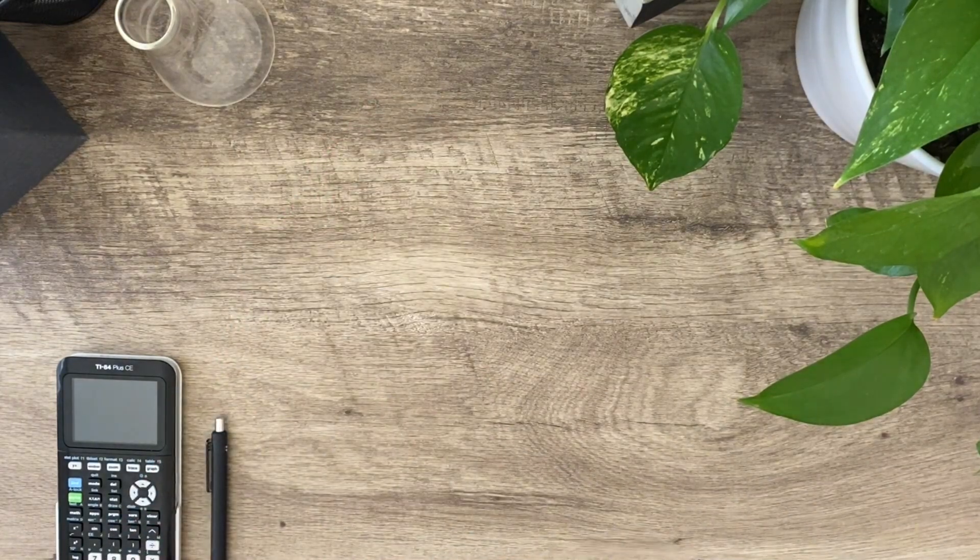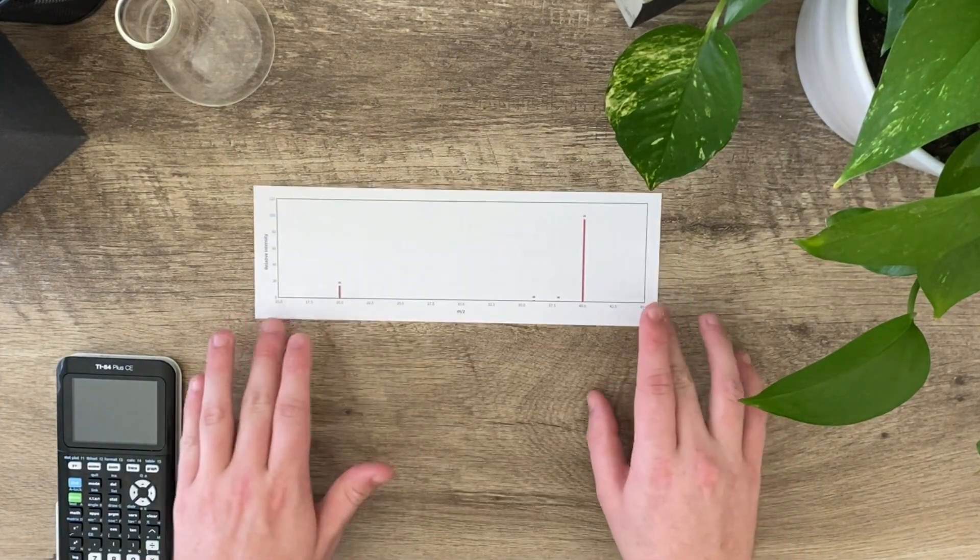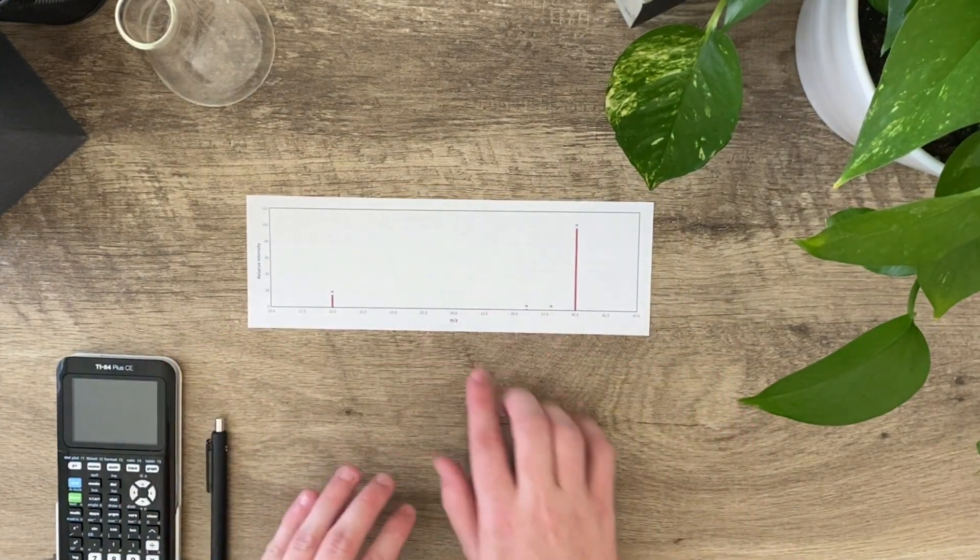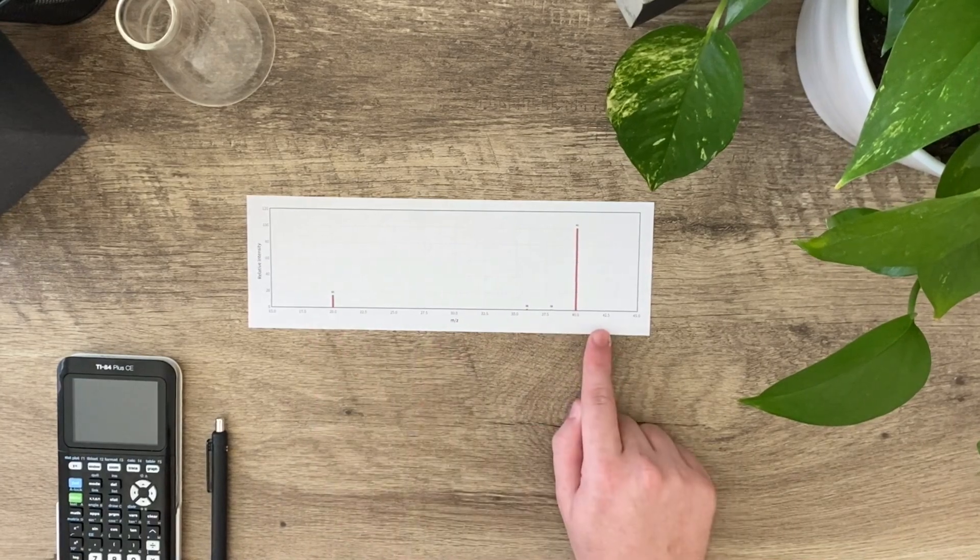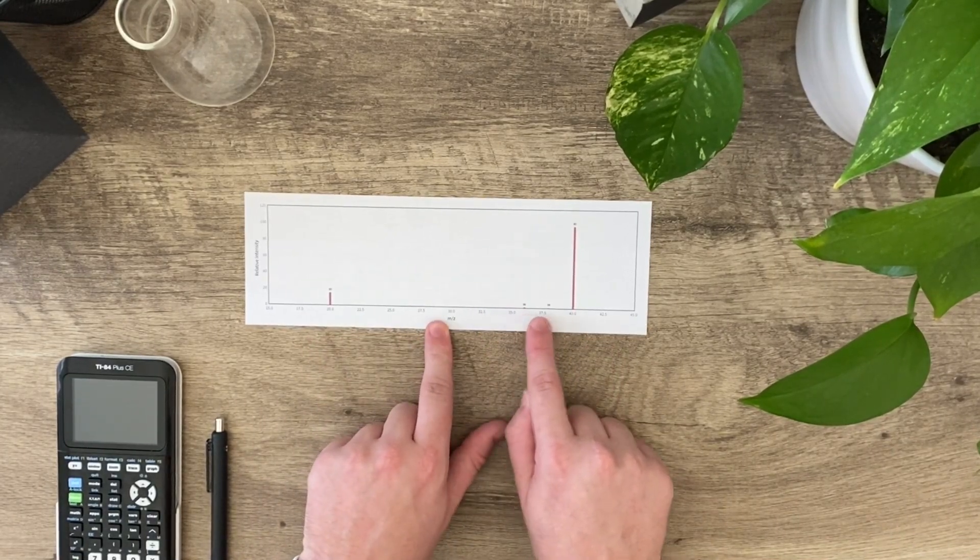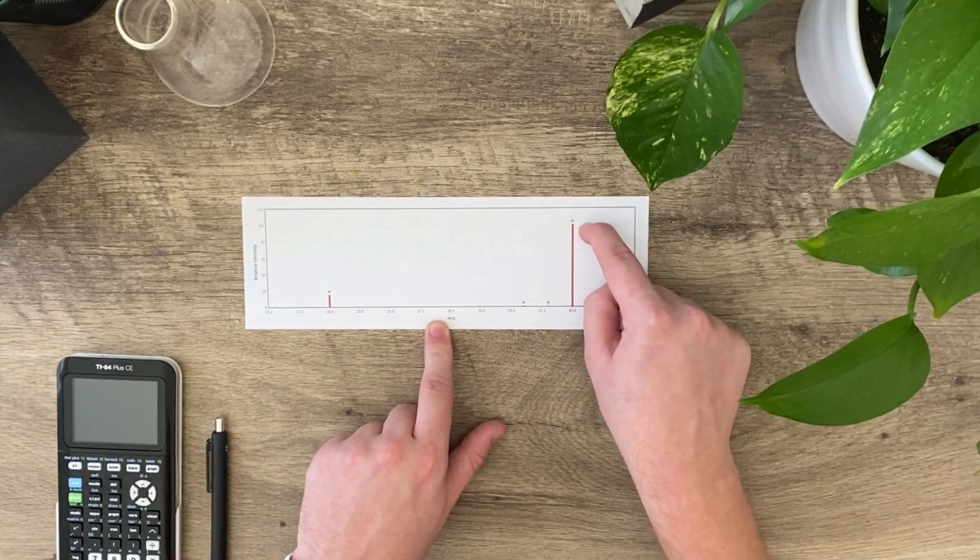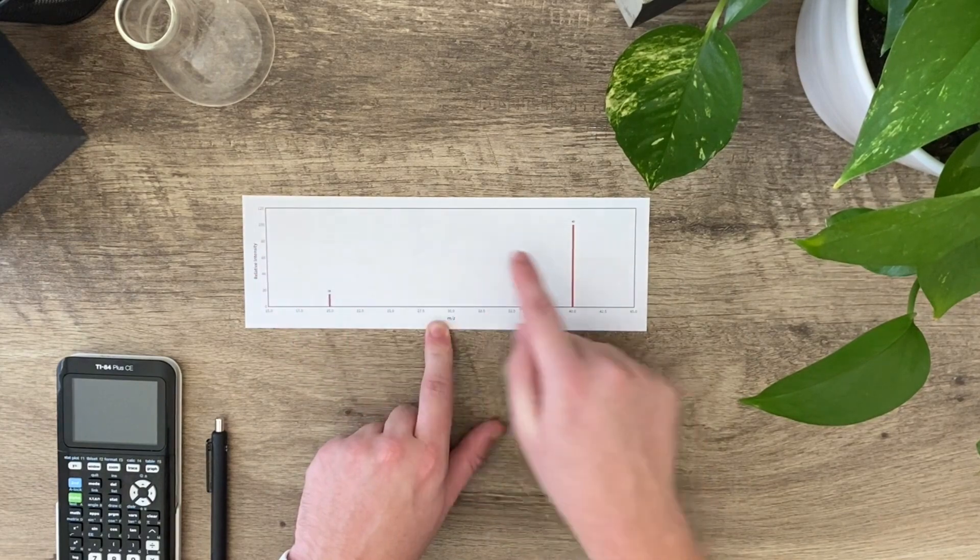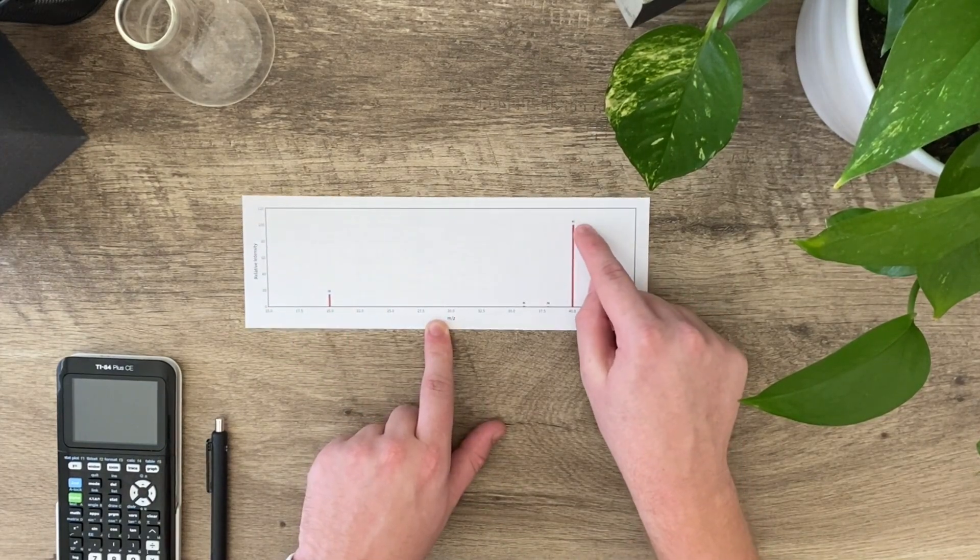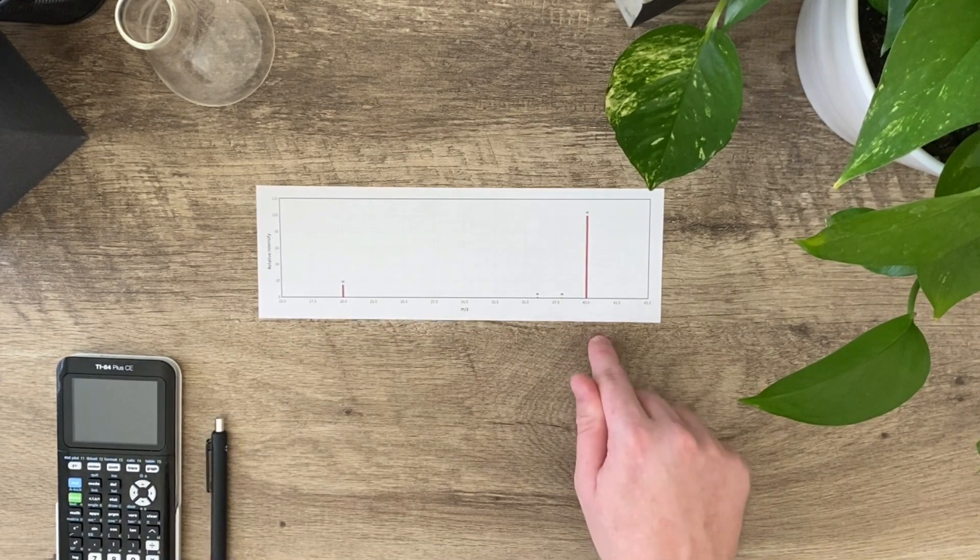Here I have a mass spec of an unknown. I clearly distinctly have four peaks here: one at 20, two really tiny ones at 36 and 38, and one here right at 40. I can see that the intensity is almost completely 40, so the abundance of whatever this atom is should be almost 40.